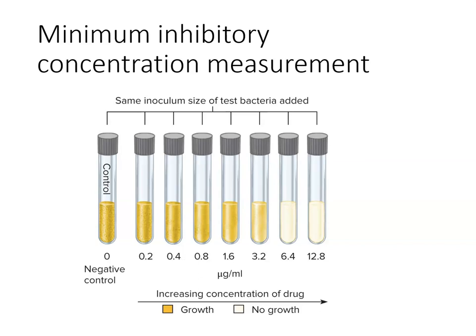Others are bacteriostatic, so they stop them from growing. In either case, they can work, but I can't say what concentration kills the cells because a lot of antibiotics don't kill the cells. So instead, we say what concentration inhibits growth, and that's what we're looking at here.